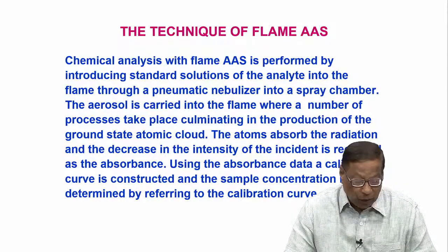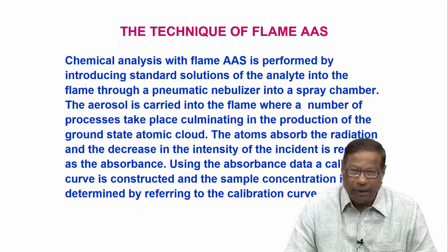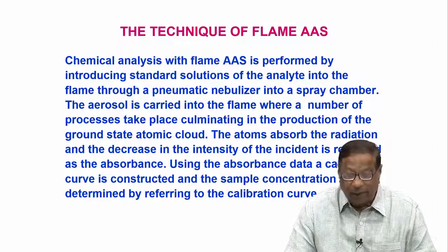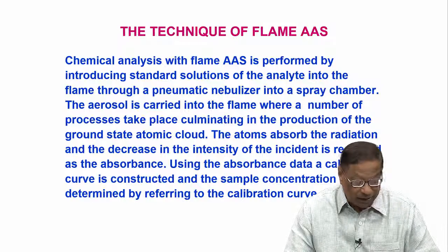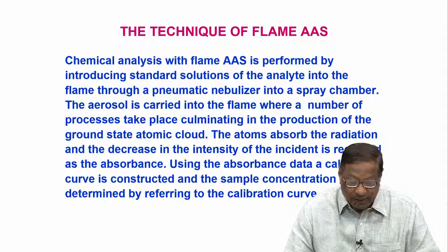The decrease in the intensity is your concentration response. So, using the absorbance data, a calibration curve is constructed and the sample concentration is determined by referring to the calibration curve.